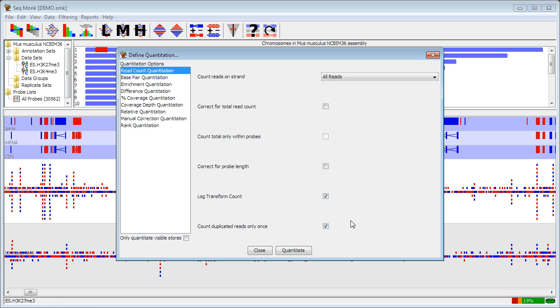I'm also going to correct for total read count which means that if I have data sets with different numbers of total reads then that will be accounted for so I don't get a bias just from having had more data in one data set than the other. And now I'm going to quantitate. It takes a few seconds to quantitate but depending on your number of probes it should be fairly quick.